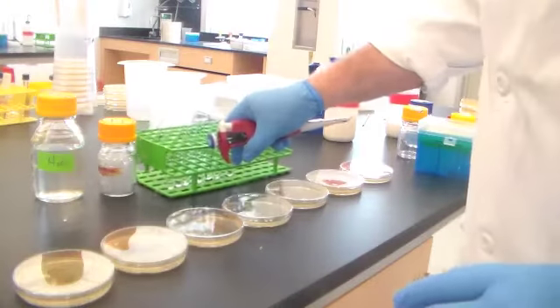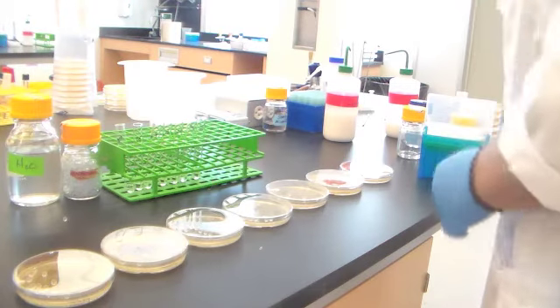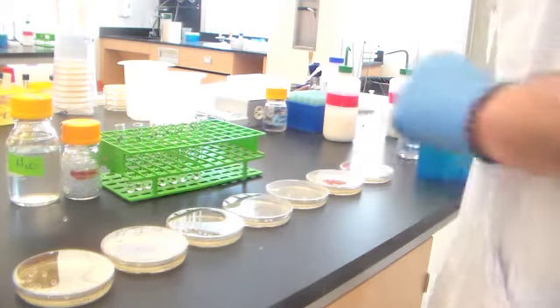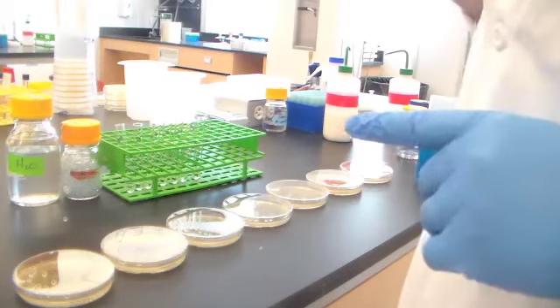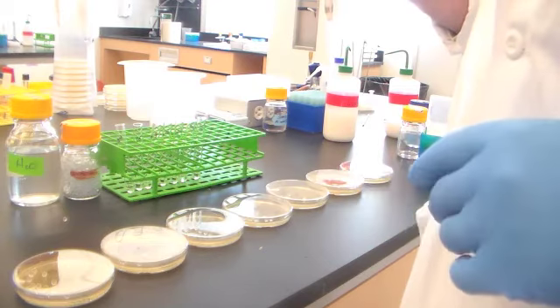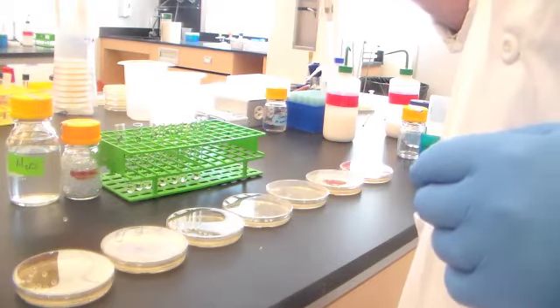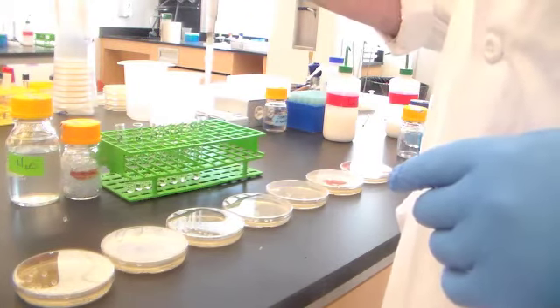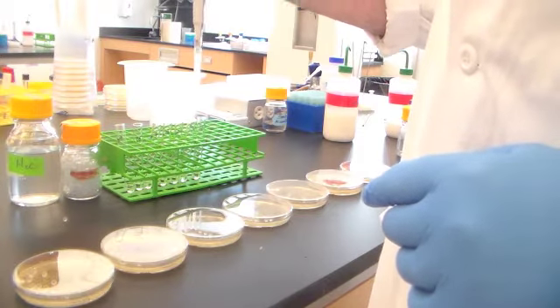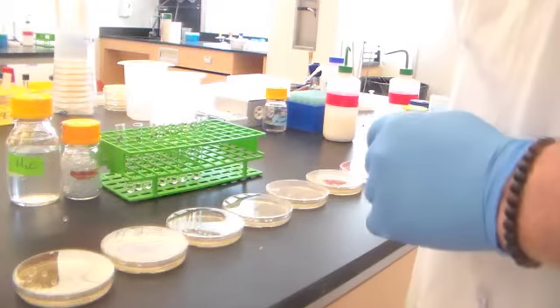Now, once I've got the beads on here, now we're going to go to these carefully prepared dilutions. And we're going to put onto each one of these plates 100 microliters. So the same volume. Now, I'm going to show you a little trick that's going to help us be a little bit more green, a little bit more sustainable. I mentioned that when you were doing the dilutions, you had to change pipette tips every time, because you were going from a high concentration of bacteria to a low concentration of bacteria.